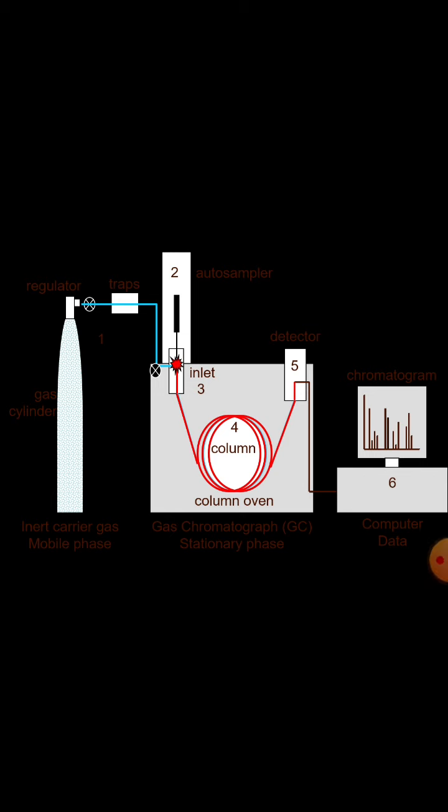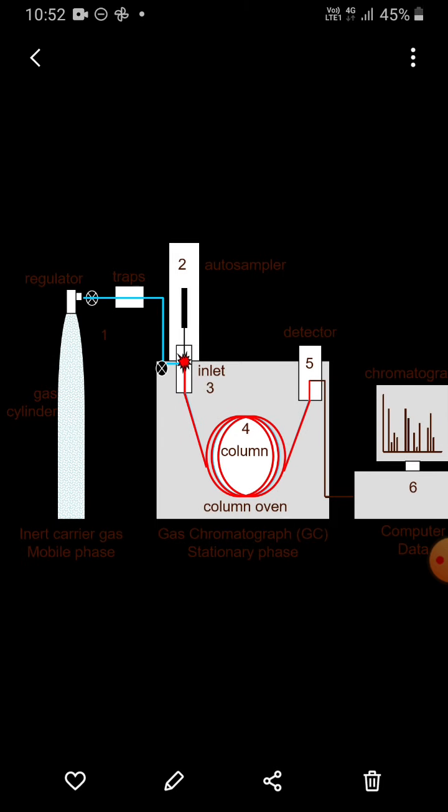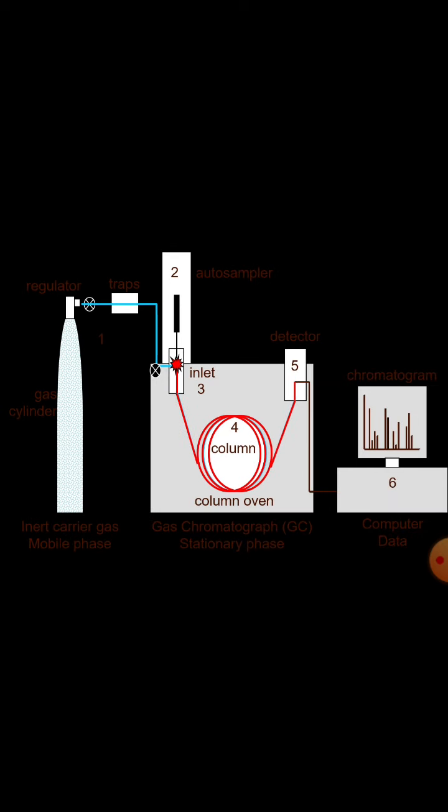So today's video will be theoretically the last video regarding chromatography for now, that is the gas chromatographic technique. Then we will discuss various questions from chromatography technique in our upcoming videos, and later in the middle of April I am going to take a full short revision class regarding chromatography. So let's discuss today's topic, that is gas chromatography.